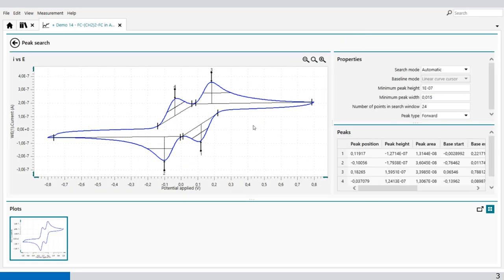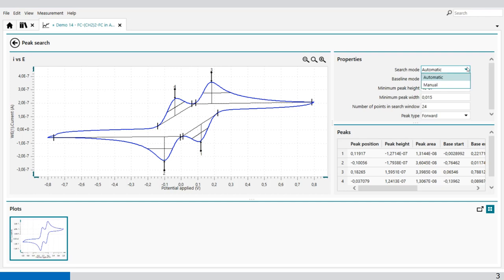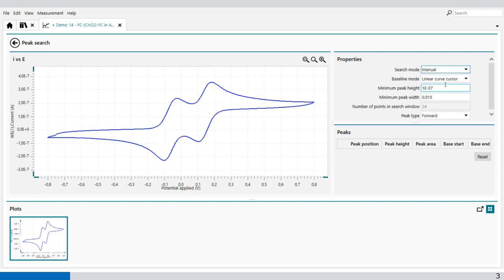It will automatically find some peaks because the search mode is in automatic. You can also do manual search, and then you have to define the baseline.